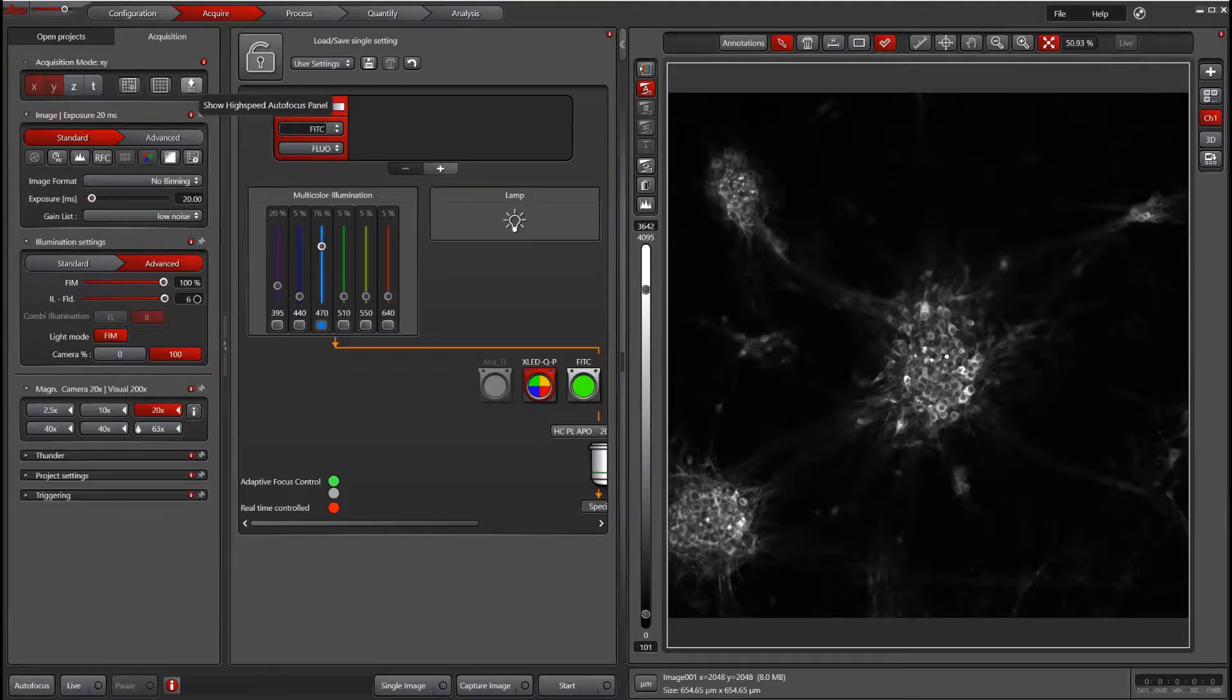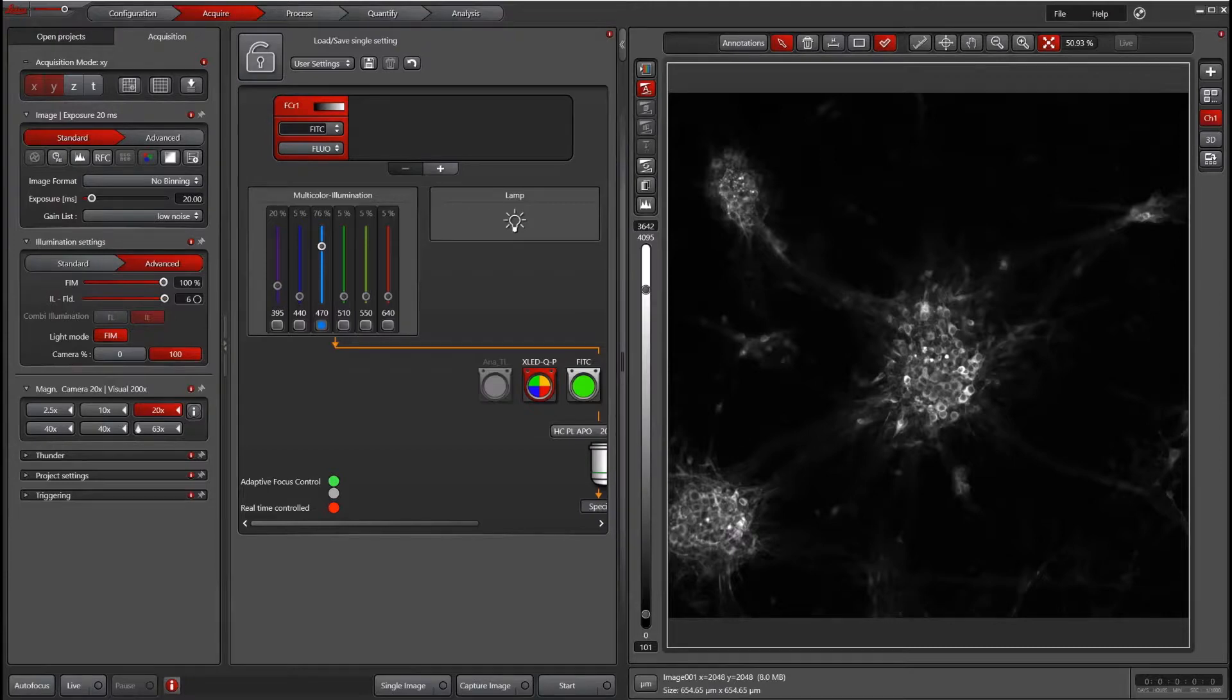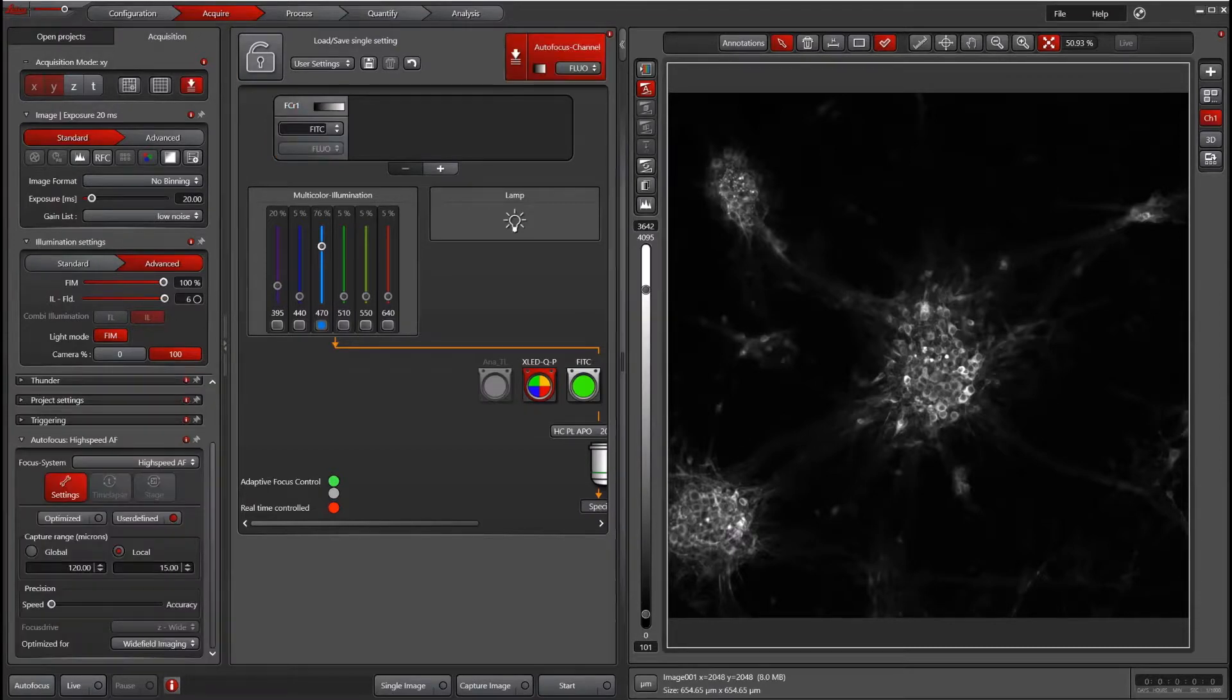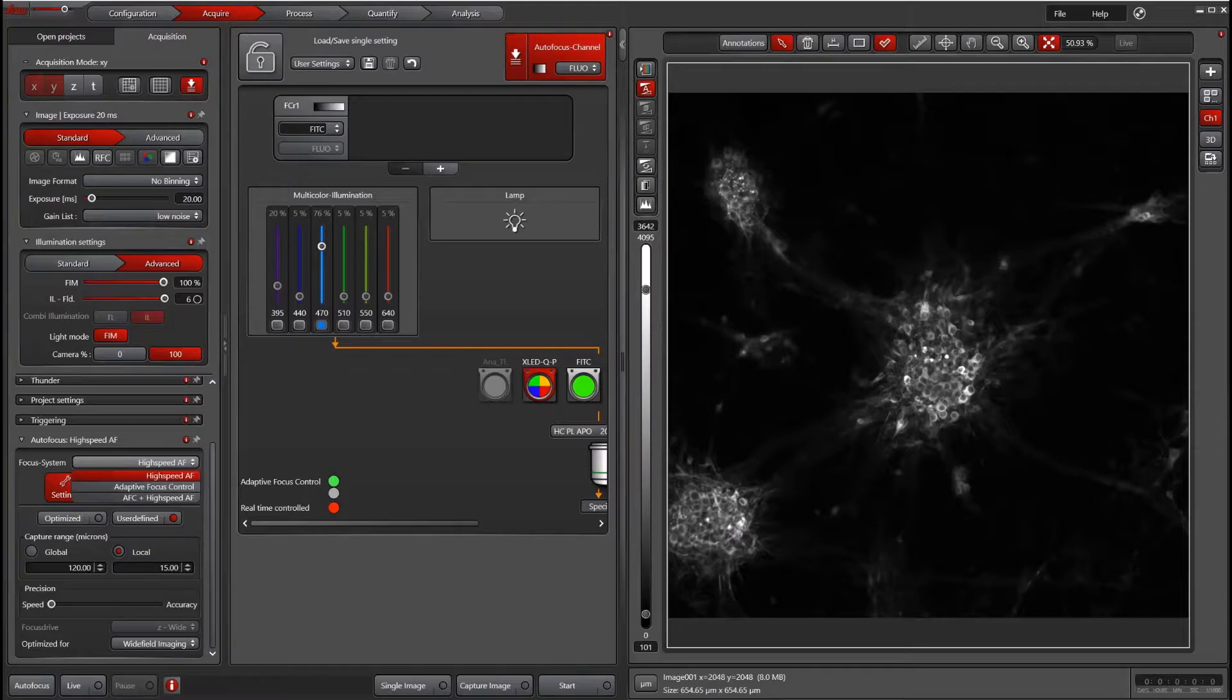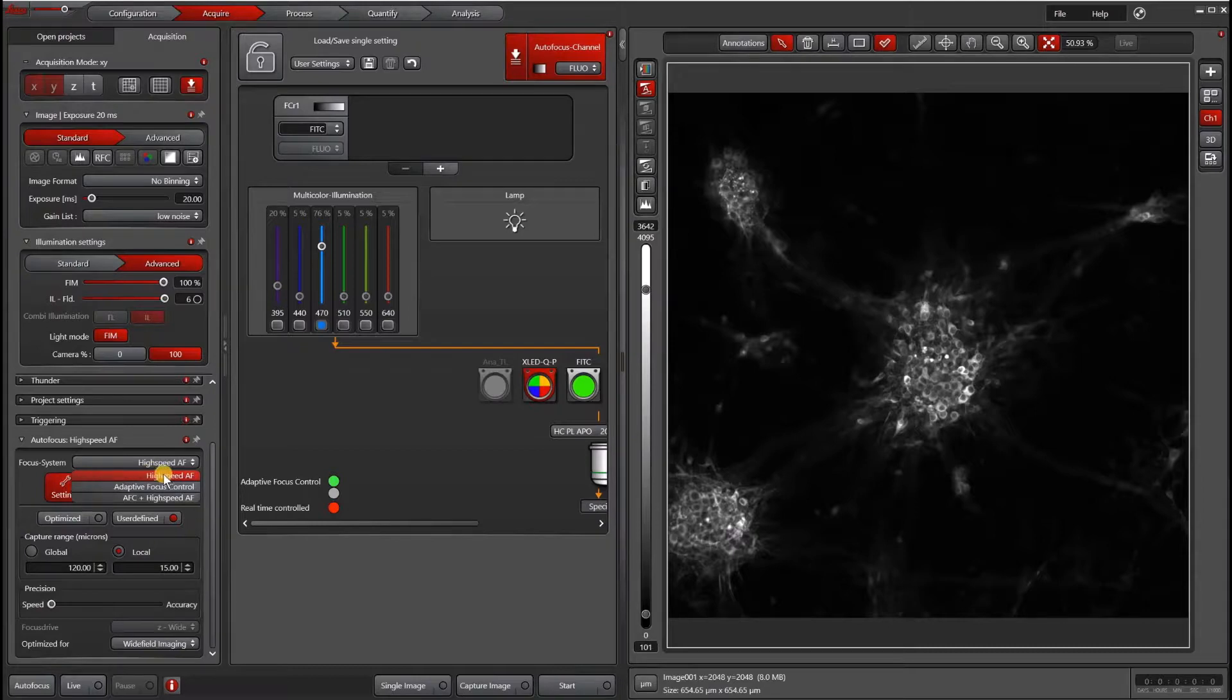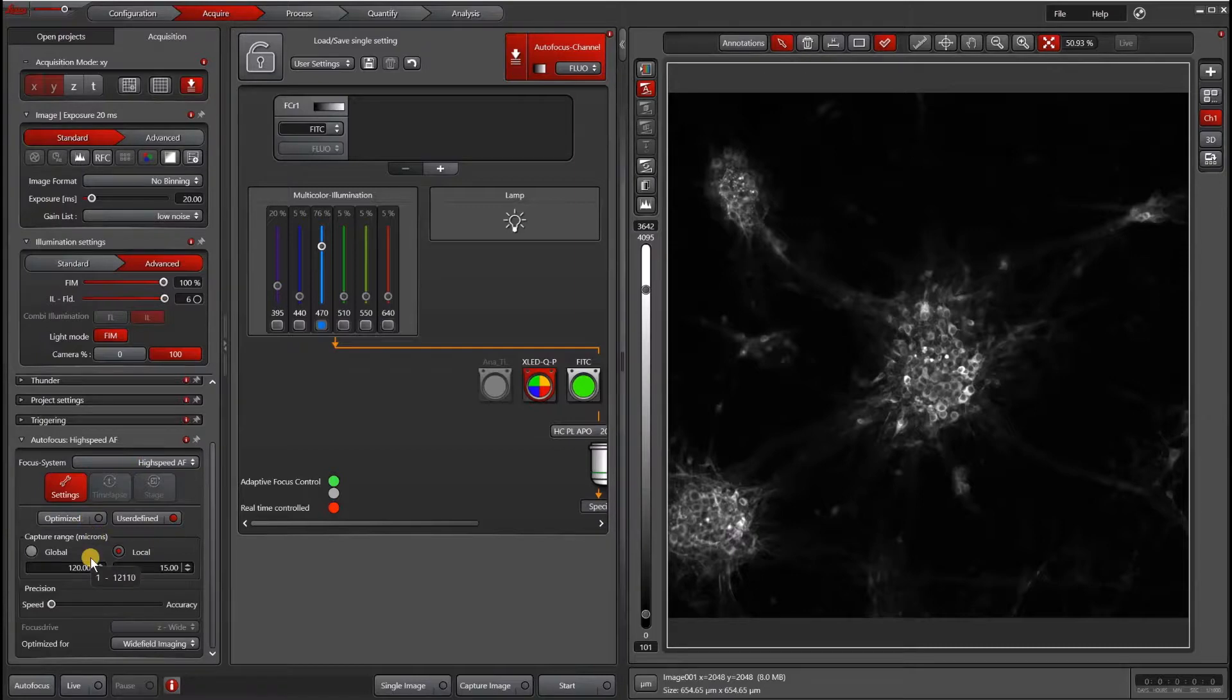To access the autofocus panel, click the high-speed autofocus or regular autofocus panel in the top part of your window. That will open an autofocus window. Under focus system, you have several choices on this system. It might not be the same for yours. The top option here is high-speed autofocus. If you only have best focus, that's where that will show up.